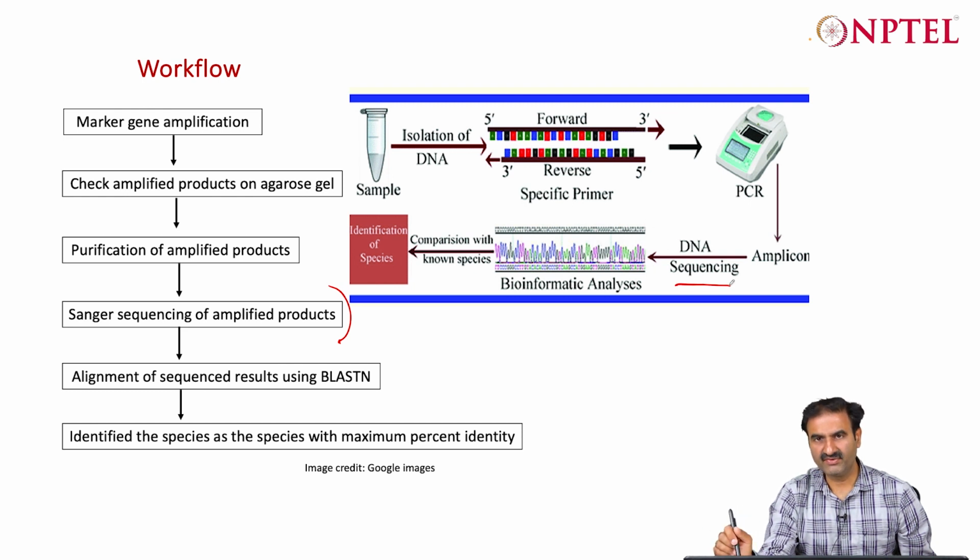Once you have the DNA sequence, you can check its quality before proceeding further. It should be good quality and a long enough region, so that it will not fail because of short regions or an incomplete match. Then you match it against a database of known species, which you will find at NCBI, and you BLAST these markers against the NCBI database.